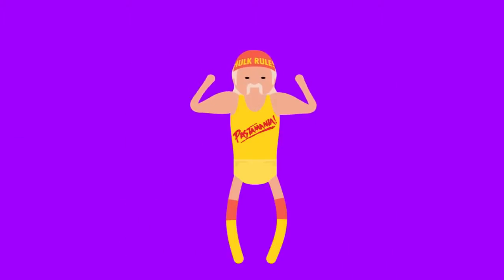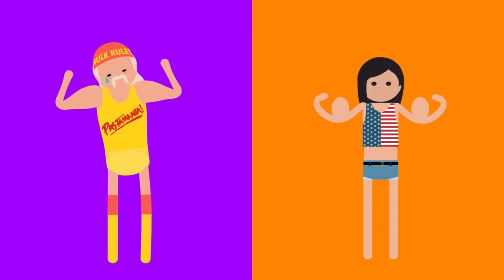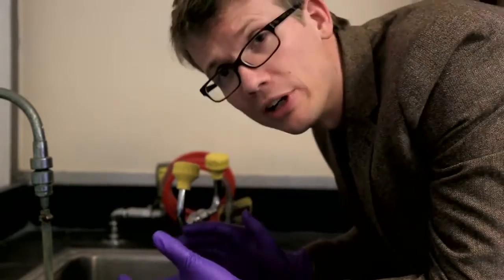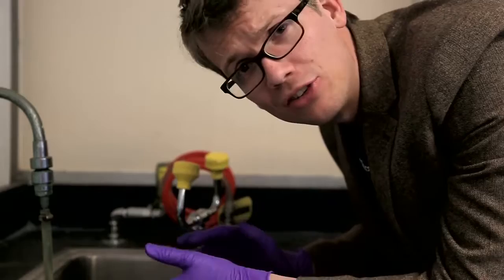Never, ever, ever wear sandals in a lab. Long pants, closed-toed shoes, and socks. Clothing that covers your entire torso. Always. I'm sure you look hunky in your muscle shirts, and I have nothing against exposed midriffs in principle, but not in the lab. Of course, your eyes are your most vulnerable organ. Always wear eye protection, and no, just glasses do not count.